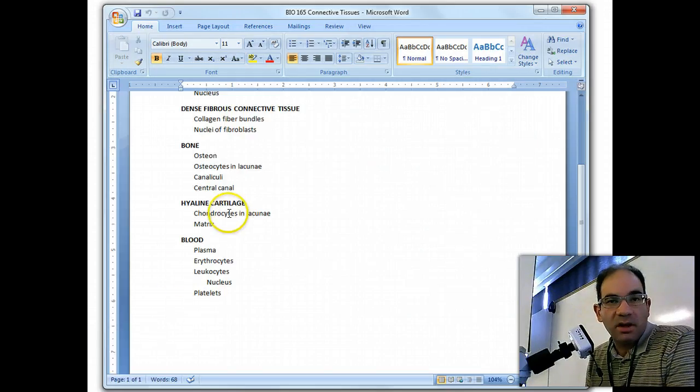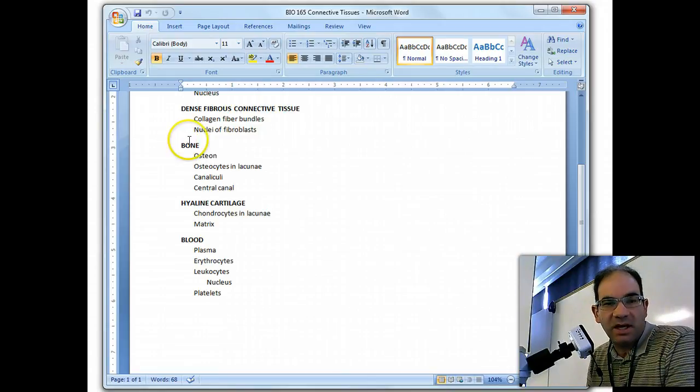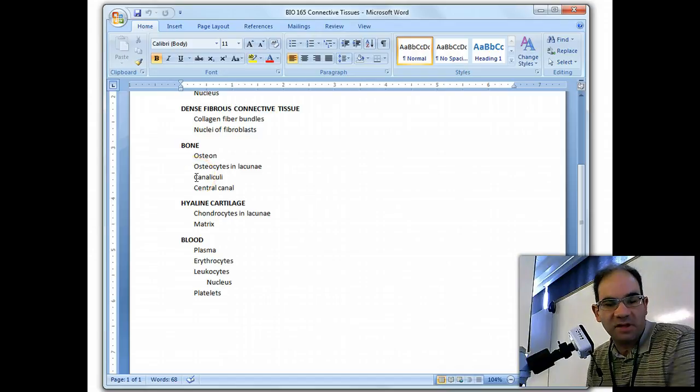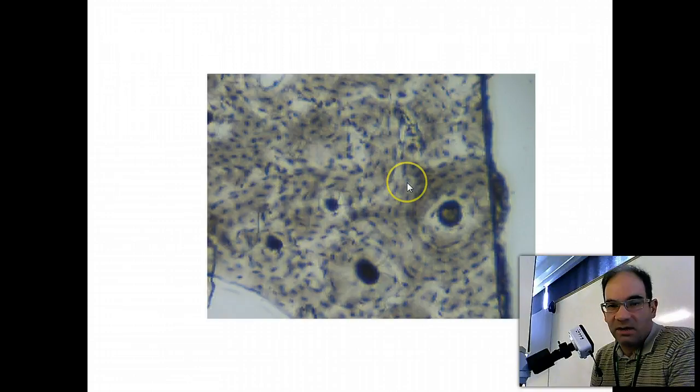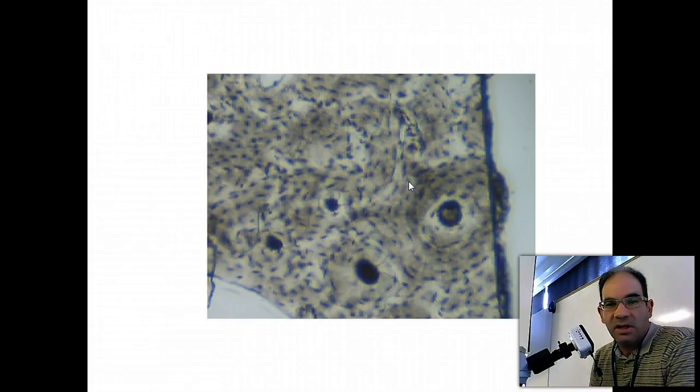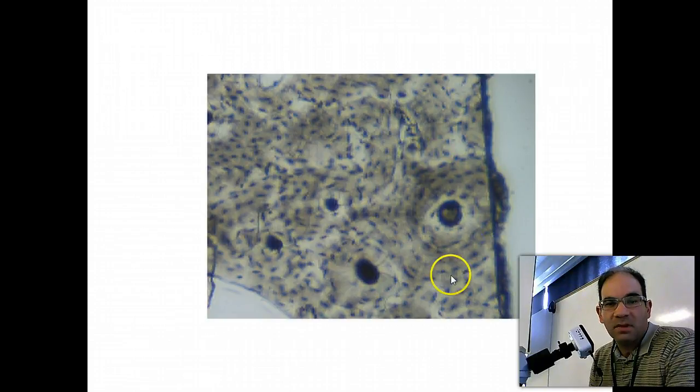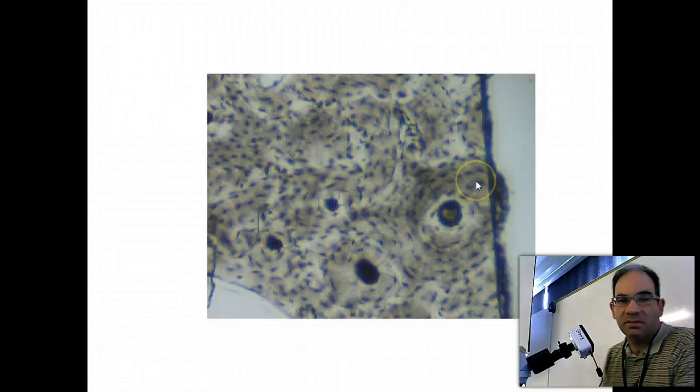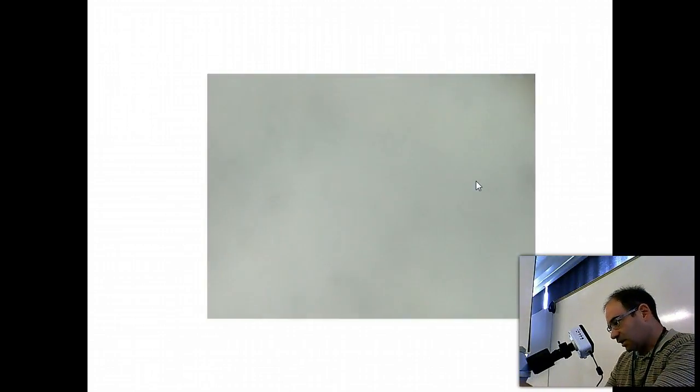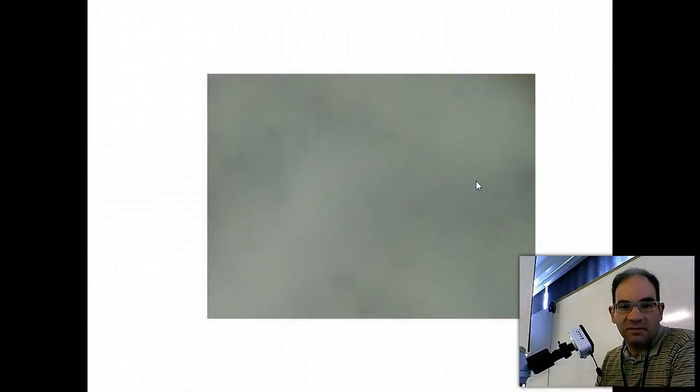Our next tissue type is bone supportive connective tissue, and you're responsible for osteon, osteocytes in lacuna, canaliculi, and central canal. So here I am at 100x, and what I want to show you here is that we have these overall functional units. These are the osteons, and so you can see an osteon right here, you can see an osteon right here, and you can see an osteon right here. And you have to be zoomed out to be able to see these pretty well. So now let's take a look at some of the structures in an individual osteon.